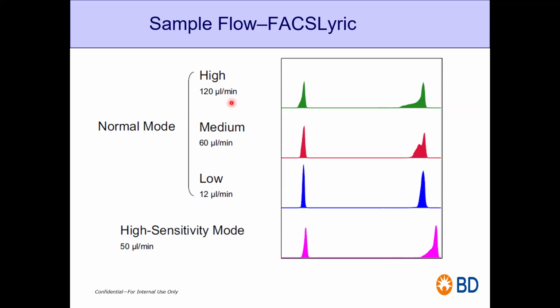And if you want to finish your PhD in 7 or 10 years, then you need low. So in that scenario, when you have a very high concentration of cells, or let's say you have 1 ml of sample, and you know that you can differentiate your population even with a small spread, you can run in high and medium as well.